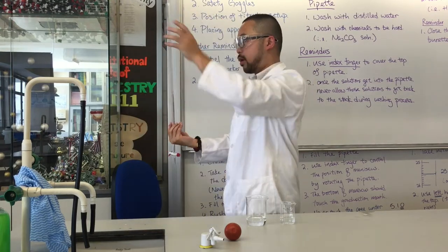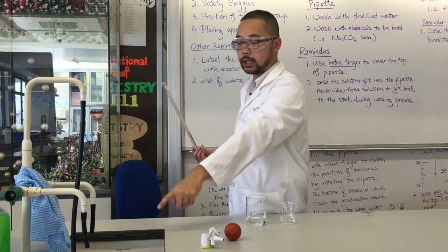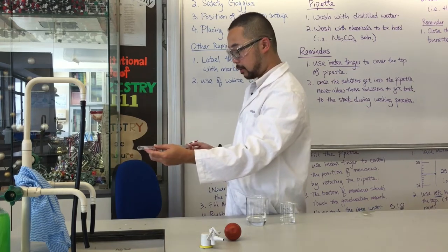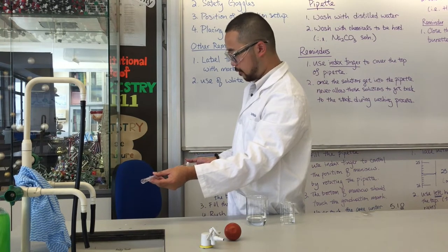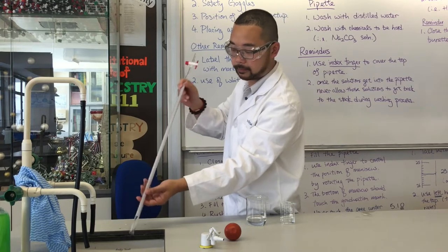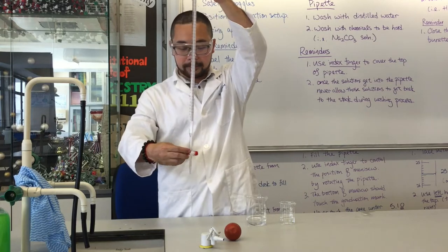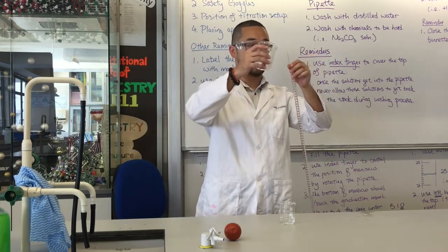Next, we're going to rinse the inner part of the burette. Remember, make sure the opening is close to the sink, so that when the liquid comes out, it gets into the sink. Place it horizontal and rotate it a bit to clean the inner part. When you think that is enough, pour the liquid into the sink and open the tap to release the last drop into the sink. After all this, you can close the tap and then fill the burette with the nitric acid.